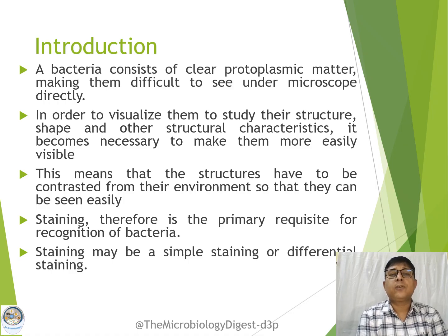Because bacteria consist of clear protoplasmic matter, making them difficult to see under the microscope directly. In order to visualize them or to study their structure, shape, morphology, and any other characteristics, it becomes very necessary to make them more easily visible under the microscope.